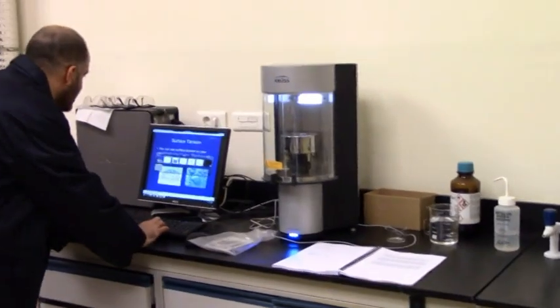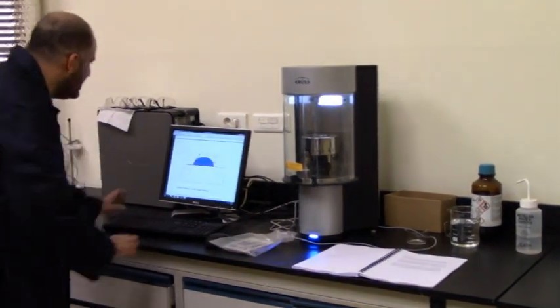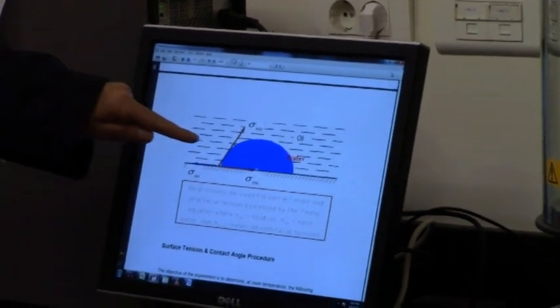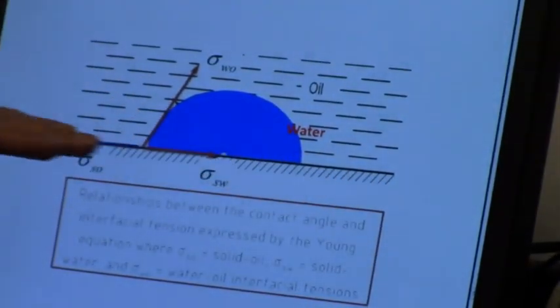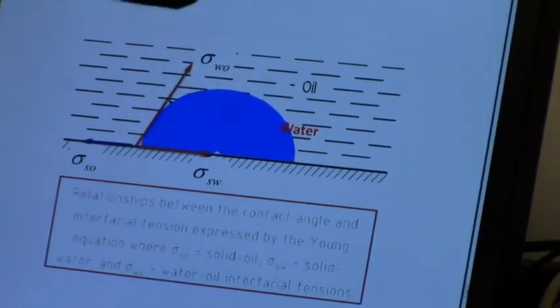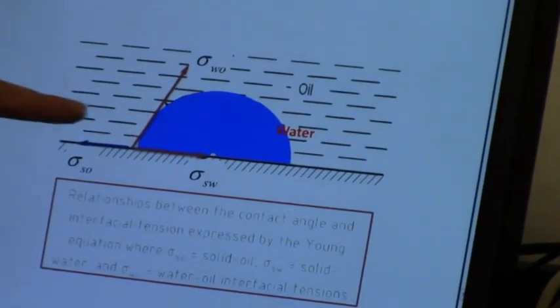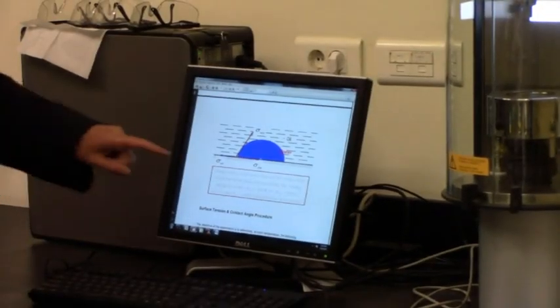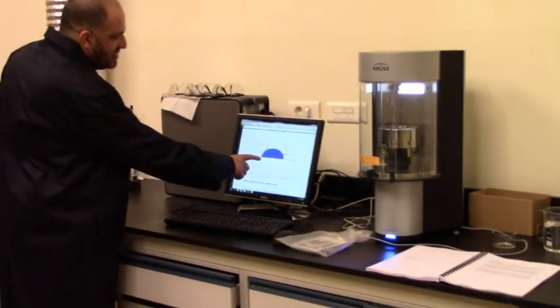The other way is similar to what we have here. We use a droplet shape, which is the liquid part similar to what we have in the vessel, against some solid surface, which is like the part that will be hanging here in the balance. And this angle is suspended inside the liquid droplet between these two vectors.